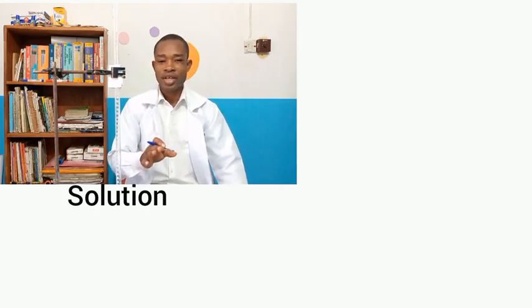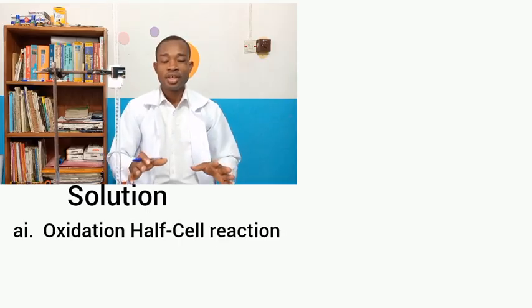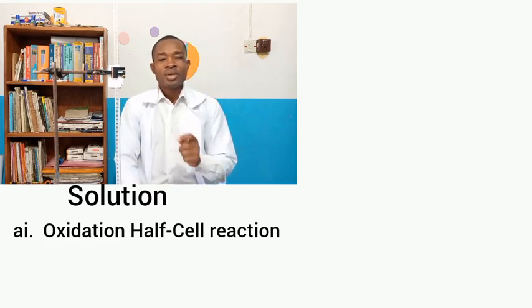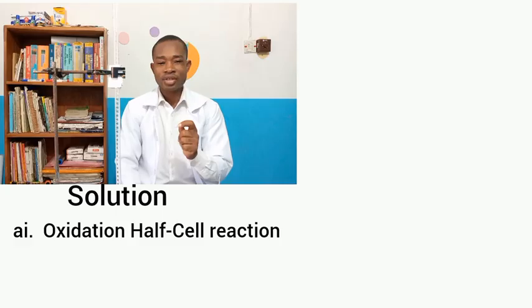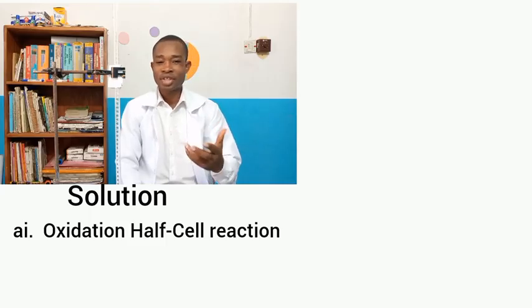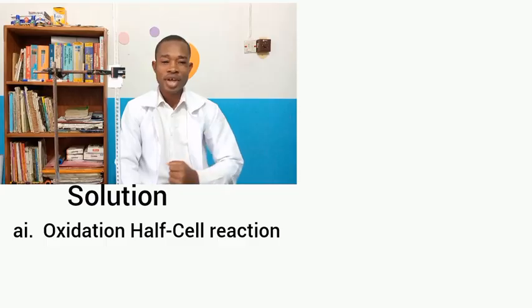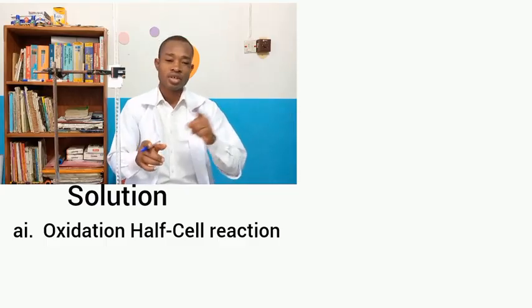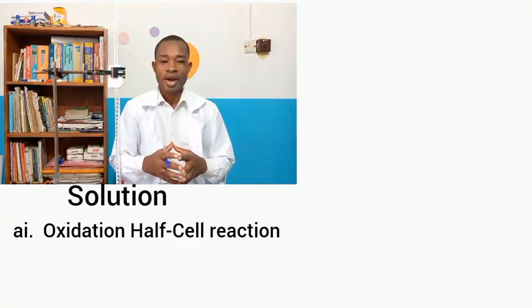And so we shall quickly take a look at the oxidation reaction in this titration experiment. Looking at the oxidation reaction, our interest is to get to know about the reducing agent. Because like I mentioned earlier, in the redox reaction process, the reducing agent will undergo oxidation. You get that right?